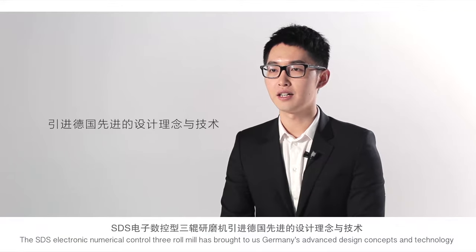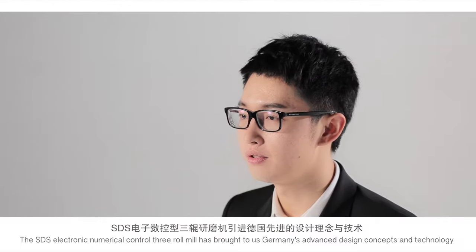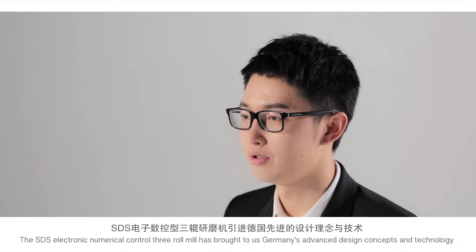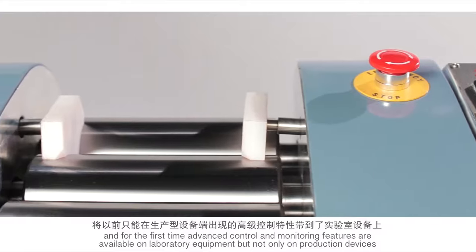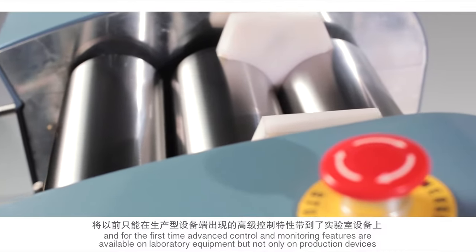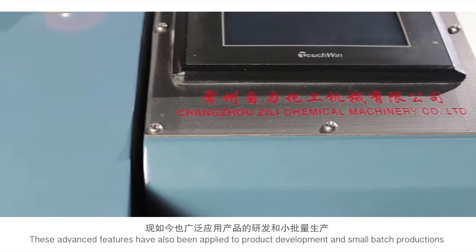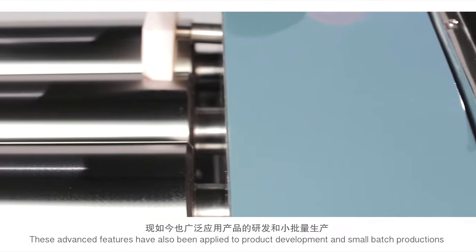The SDS electronic numerical control three roll mill has brought Germany's advanced design concepts and technology. For the first time, advanced control and monitoring features are available not only on production devices, but also on laboratory equipment, and have been applied to product development and small batch productions.